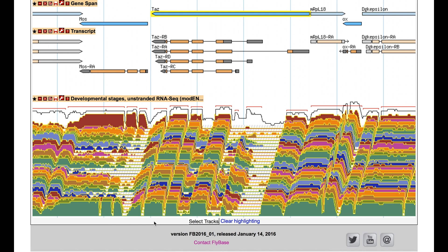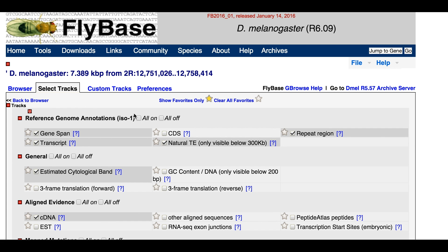Additional ARNESIC analysis can be viewed by clicking on the Select Tracks option at the top or bottom of the GBrowse page.